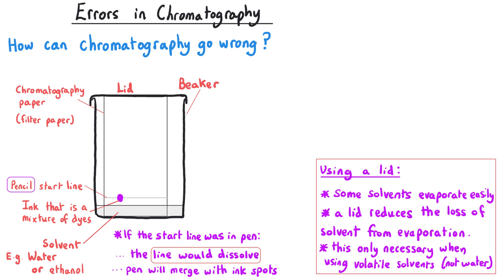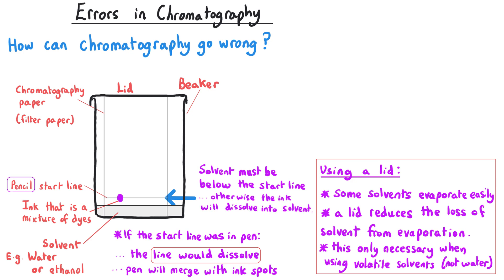It's really important to make sure that the level of the solvent touches the paper but doesn't go above our starting pencil line. If it does, the spot will dissolve in the solvent — the water will take up the colour of those dyes, so the solvent might become purple in the case of a purple dye, meaning the dye might not rise up the paper at all and instead go downwards into the solvent.